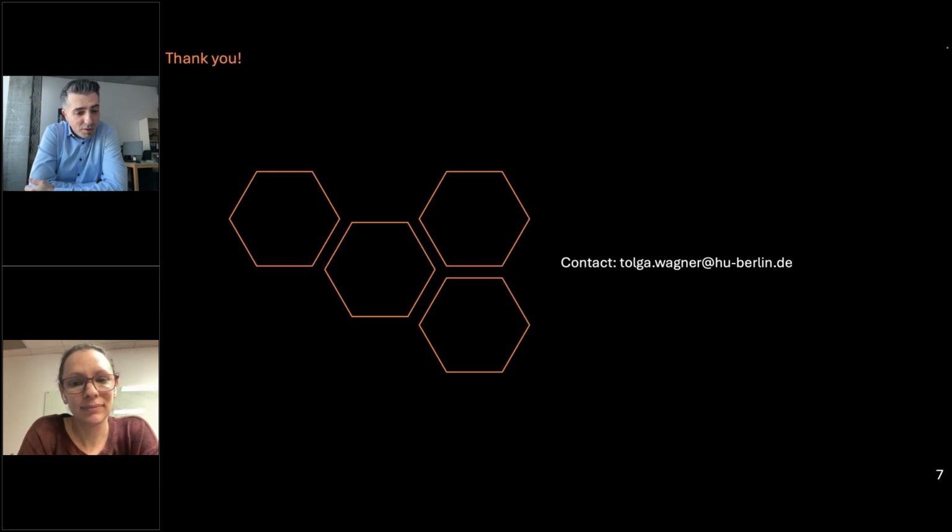Of course, a lot of people have compared DPC to holography. Benedikt Haas did a very, very good paper on it. So we are trying to combine it with different techniques. But for me, in most cases, I'm interested in phase imaging and the imaging of the derivatives of the phase of an electron wave.